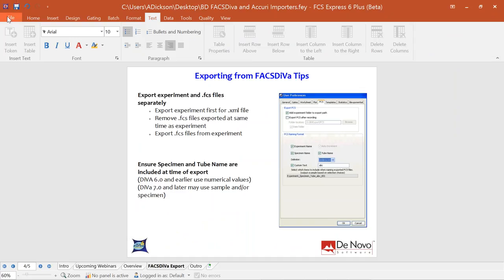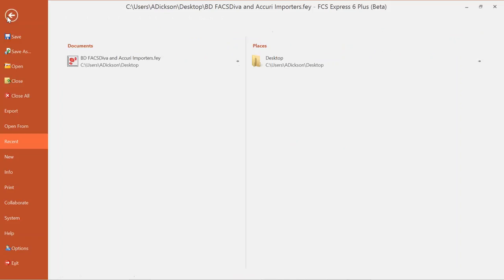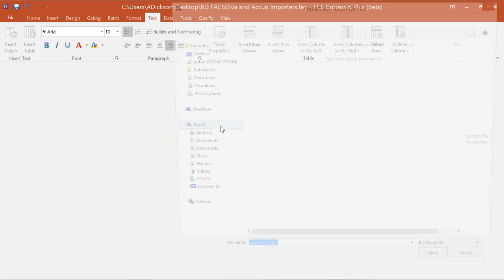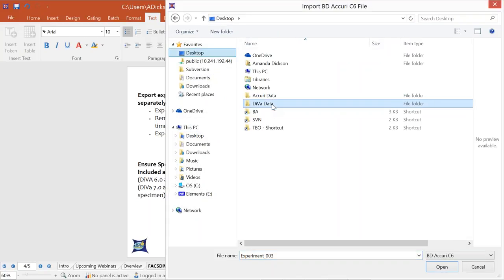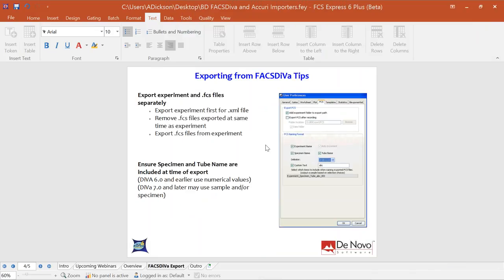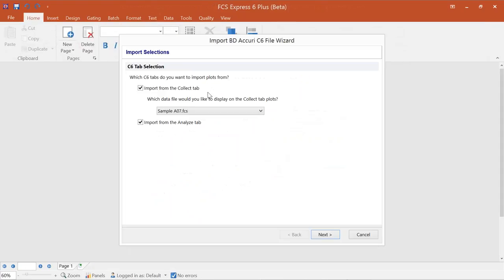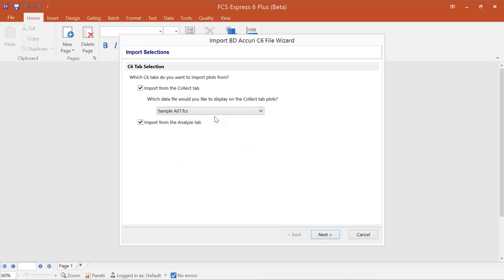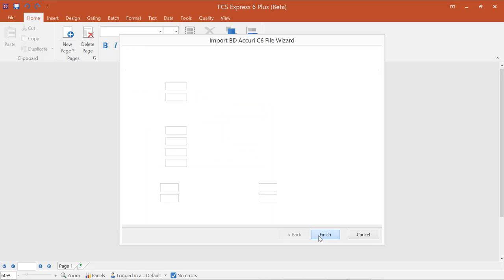Now we'll jump into the Accurie importer — same workflow, very similar. Go to the File tab and select Open From, then choose BD Accurie data. Navigate to where your Accurie data is located. Here I have a plate format but I'll load the files individually. Click Open and run through the wizard. For Accurie data, you can import from the Collect or Analyze tabs, and from the dropdown menu you can specify which file is used to plot data in the first import.